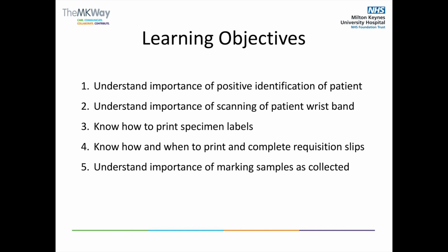You will know how to print specimen labels. You will know how and when to print and complete requisition slips. And finally, you will understand the importance of marking samples as collected.